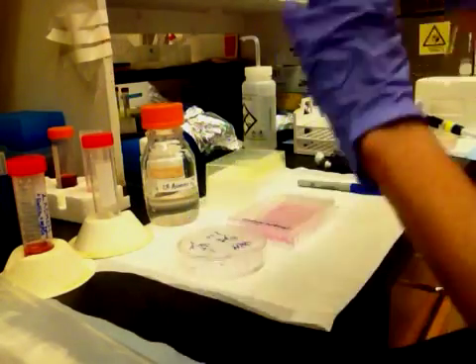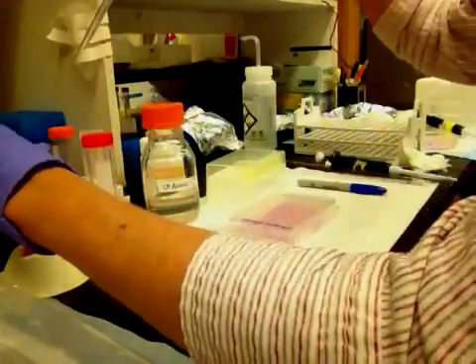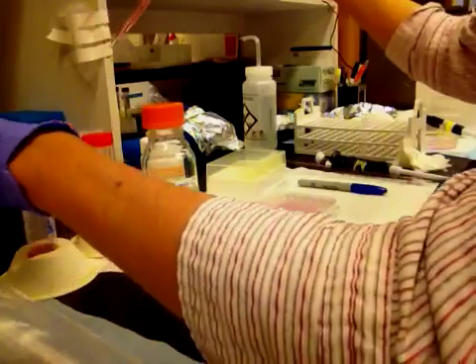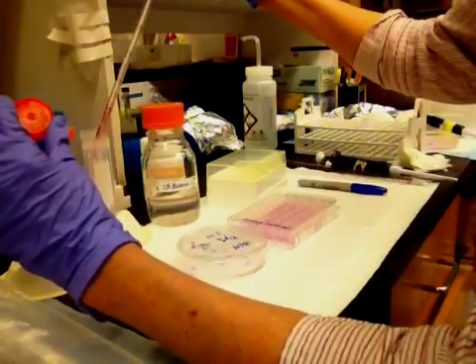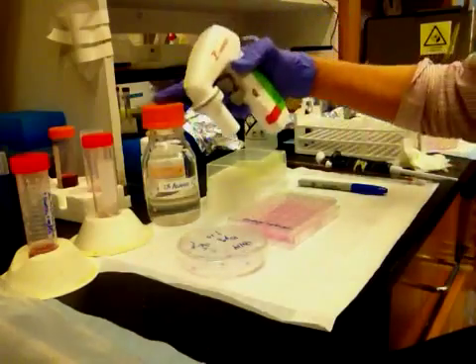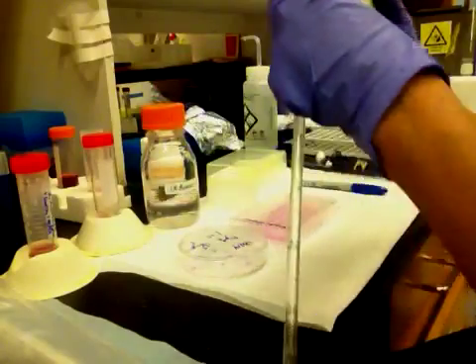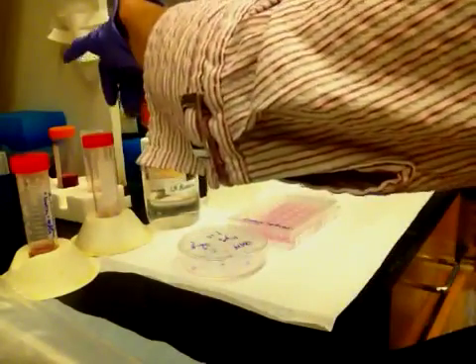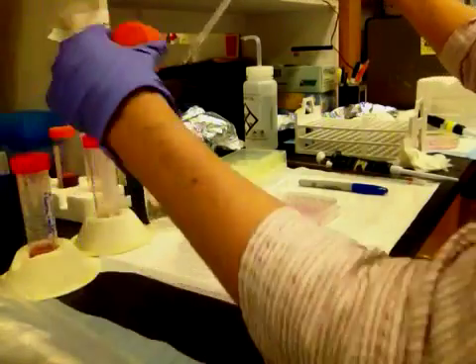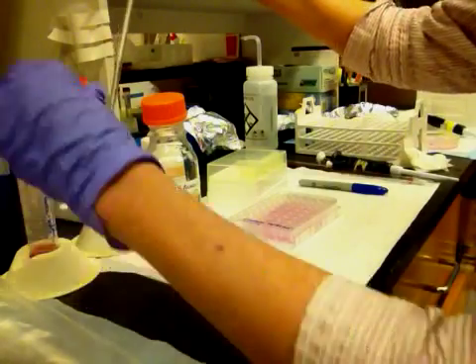The next thing is to combine the agar and the 2x DMEM. The 2x DMEM has been prepared with HEPES, bicarb, glutamine, and everything that cells like. Now I'm going to mix it one to one with this agarose that I have microwaved, which is extremely hot — it takes a few minutes of microwaving and should be completely liquid. I'm going to mix this and it will remain liquid when mixed with the 2x DMEM.